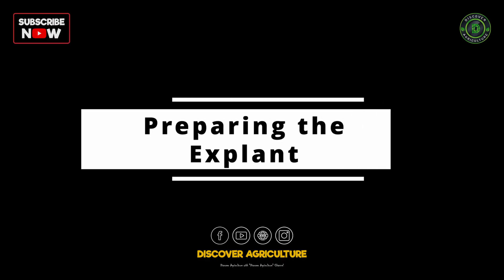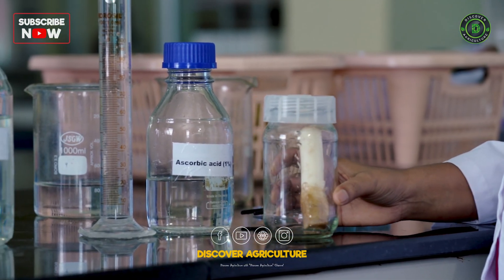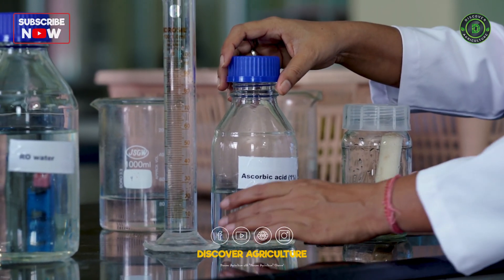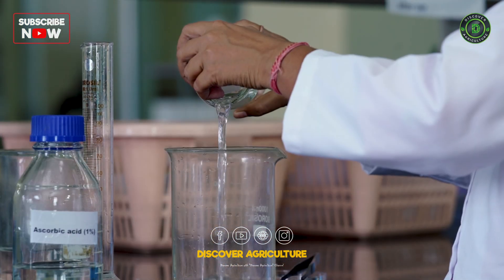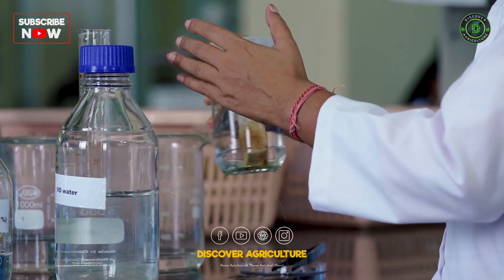Preparing the explant. Next, we place the explant in a glass jar. As you may notice, the lower portion turns brown due to the high amount of polyphenol in the banana. To reduce these polyphenols, we treat the explant with a 1% ascorbic acid solution for 2-3 minutes. Afterward, we rinse it with sterile RO water 3 times.